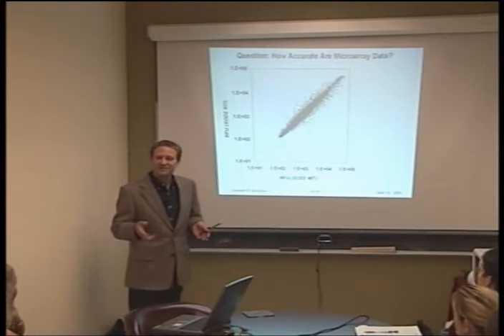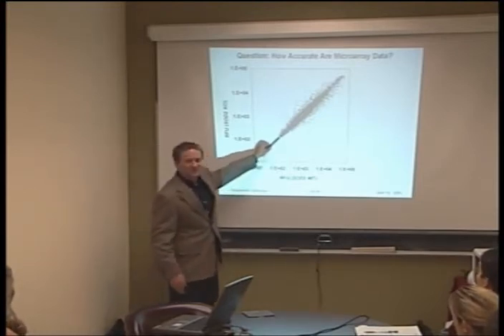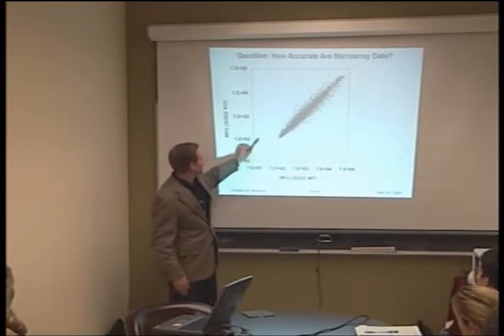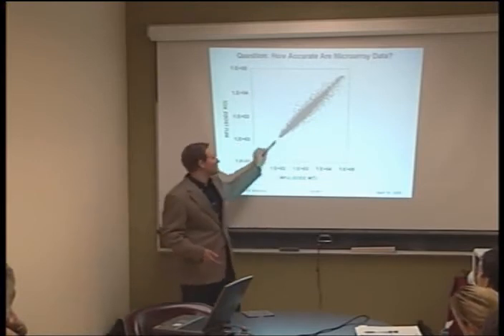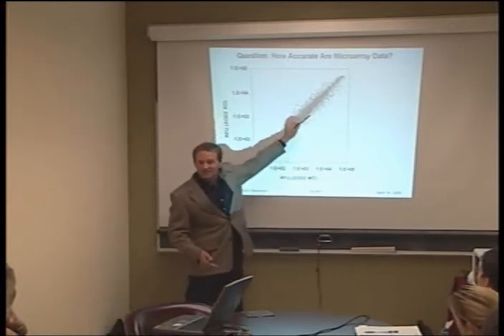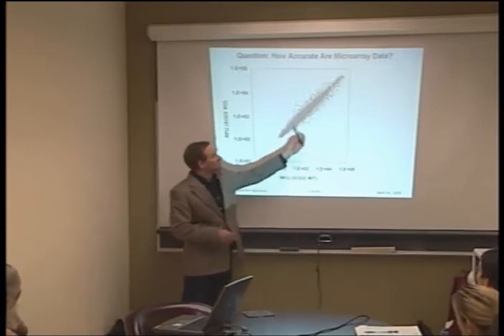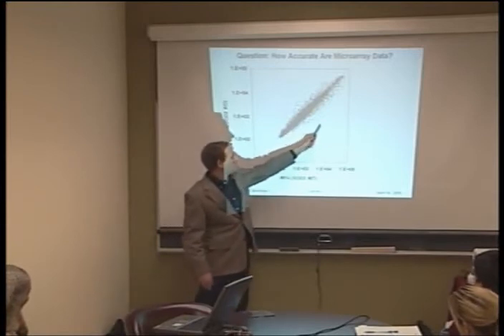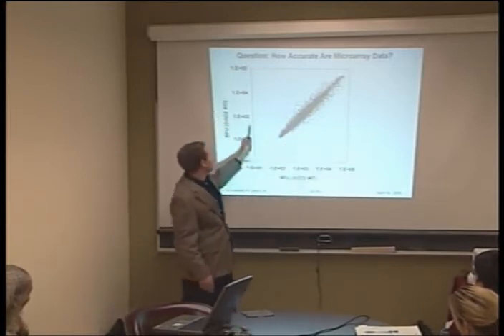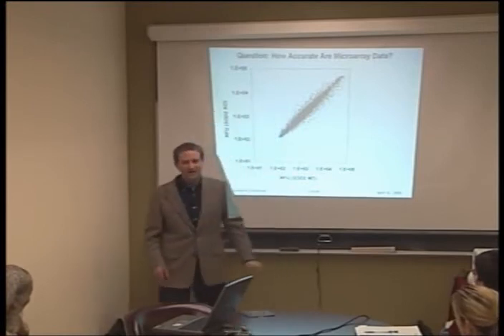And the question was, well, which genes are expressed differently in these mice? Essentially, if there was no difference between these 2 mice, you'd expect that each of these data points represents one gene. And this would be the expression level in the knockout mouse versus the wild type. And if there was no difference between the 2, this would be a very, very tight line that went right up the middle of the plot, because it would mean that there was no difference between the 2. To the extent that there are genes that vary on either side of this, that means that they're expressed at a higher level in the wild type than in the mutant, or at a higher level in the mutant than in the wild type.